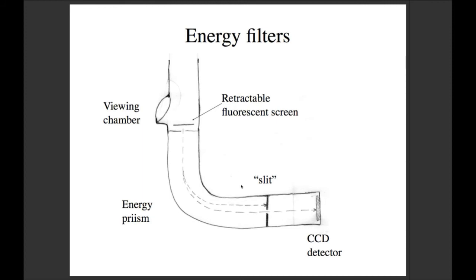And also it can be used in spectroscopy, so you can change that range so that you can see different elements that excite at different, not wavelengths, changes in their energy loss. Yeah, something like that.